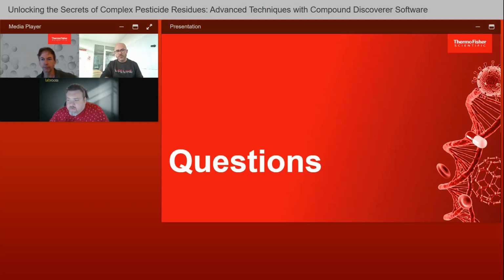All right, got time for a few more here. Julio, why did you create additional variables for coformulants from the same data when KM plots are already available?